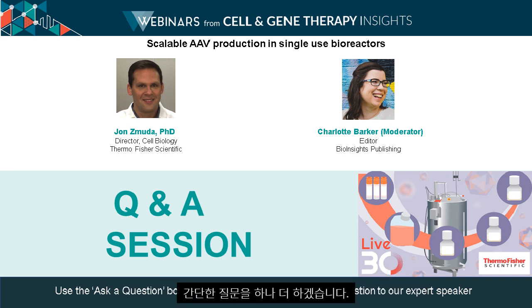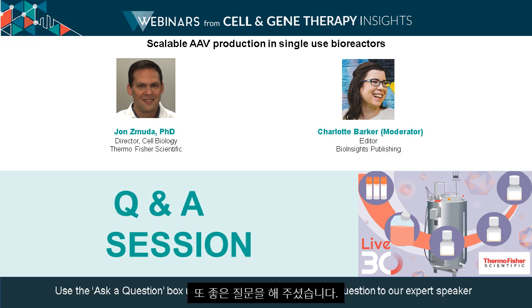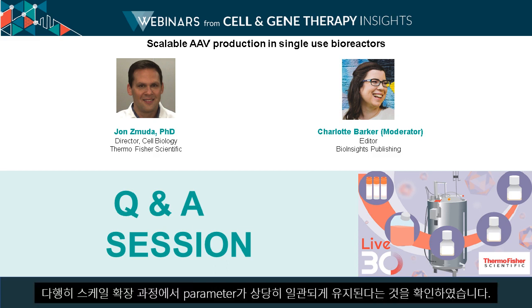Absolutely, and we'll squeeze one more quick question in. What are the recommended run parameters for the VPC cells in a 3-liter and then a 10-liter reactor run? Oh, another great question. And again, it's been very welcome for us to see that the parameters as we scaled up have remained quite consistent.